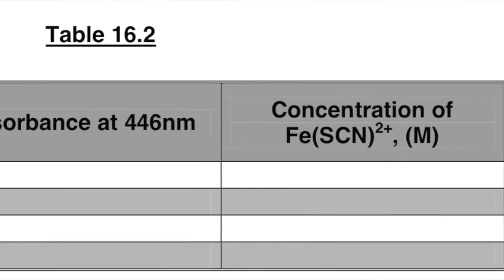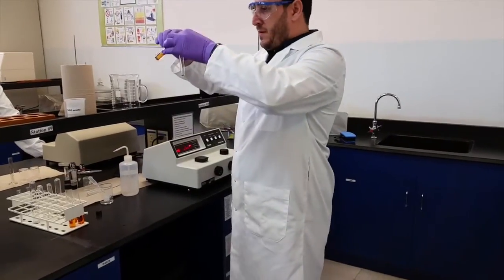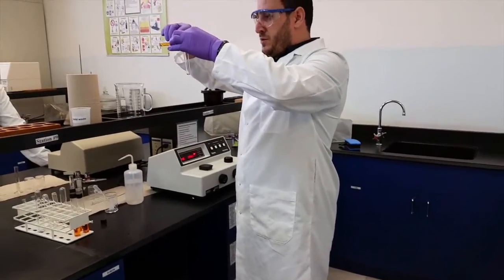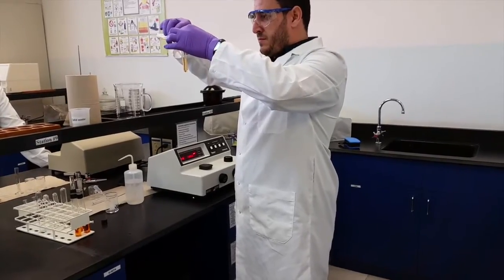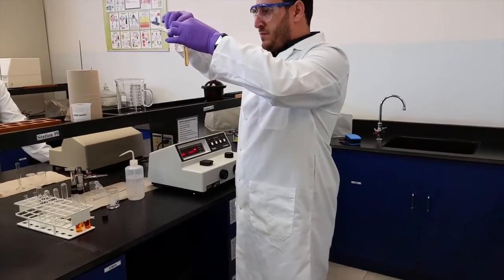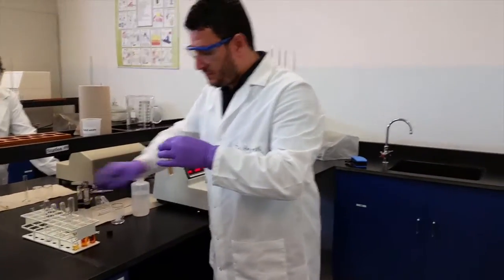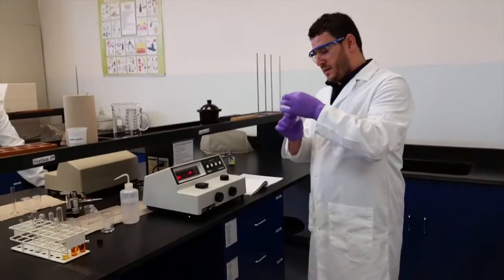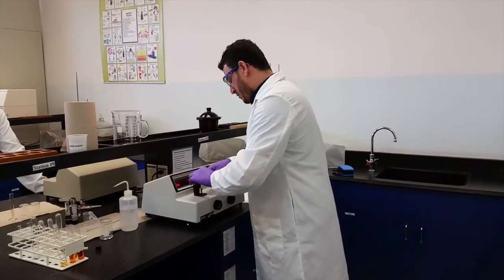You simply take your solution, the first one, transfer it to the tube. Make sure your tube is clean again and measure the absorbance.